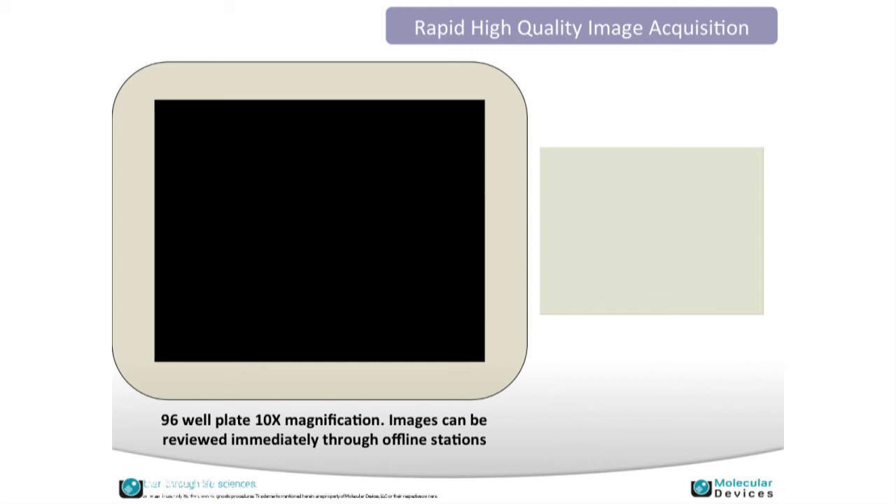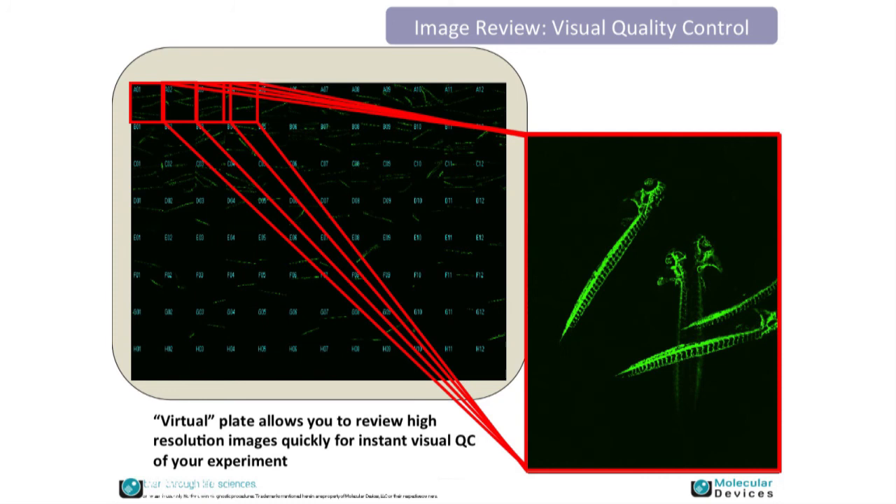Once acquisition is finished, we can review our images. Seeing the plate at this high level allows us to pick out any discrepancies — for example, checking for cell distribution issues. These are low-resolution thumbnails, and clicking on any of them pulls up a high-resolution image for review and analysis.